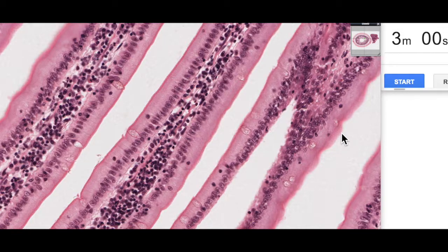So in the last episode we talked about the distribution of hematoxylin and eosin staining, acidophilia, basophilia and interpreting. So we're just going to continue that discussion and have a look at some other cell types and refer them to the cellular structure and relate them to the staining patterns that we see. So let's start our three minutes.